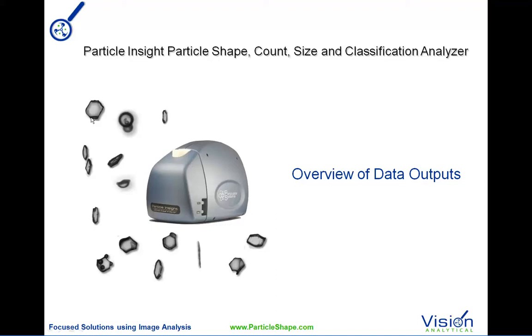So it's a very high-speed instrument, and it works very quickly with the analysis. But obviously, one of the things we need to do is to output the data. So we'll be reviewing the different data outputs of the Particle Insight.